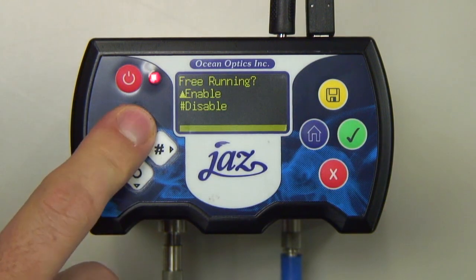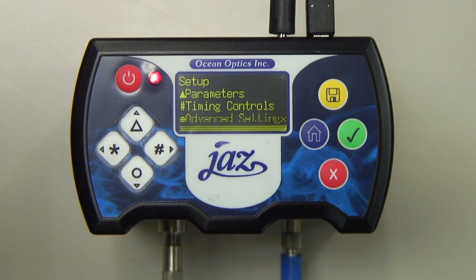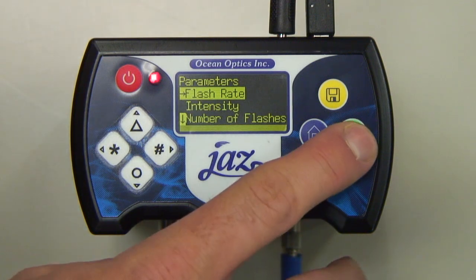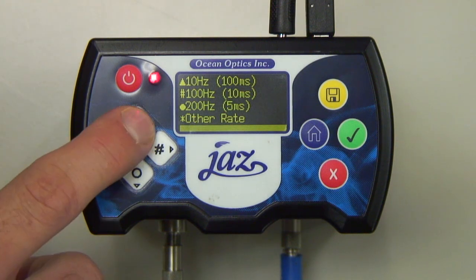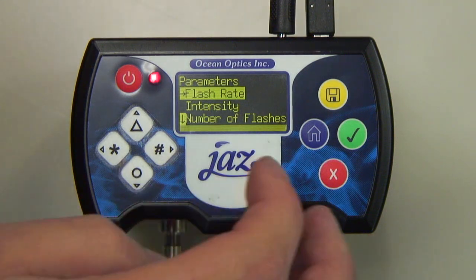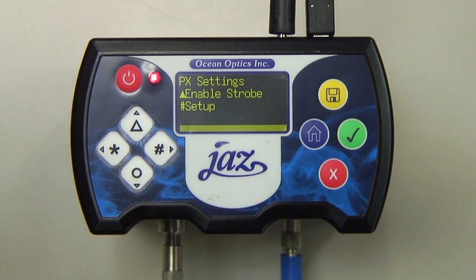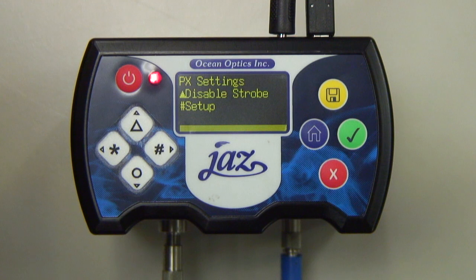The PX Lamp is now set to Free Running Mode. Press X to return to Setup and press the Triangle button to select Parameters. Here is where we'll set our Flash Rate — for this setup, we've chosen a rate of 10 Hz. Pressing X twice returns us to the PX settings, where you'll choose to enable the strobe. The Jazz PX is now operating in Free Running Mode at a Flash Rate of 10 Hz. Note that if the Jazz Spectrometer is turned off, your parameters will automatically be reset.